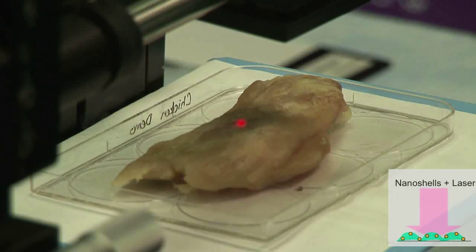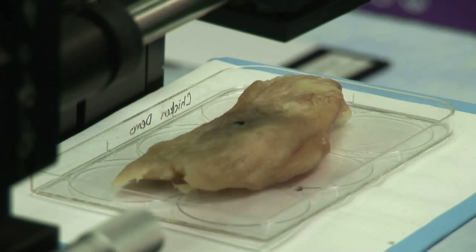It's been 45 seconds. We're going to turn this off. So, we've killed our tumor.